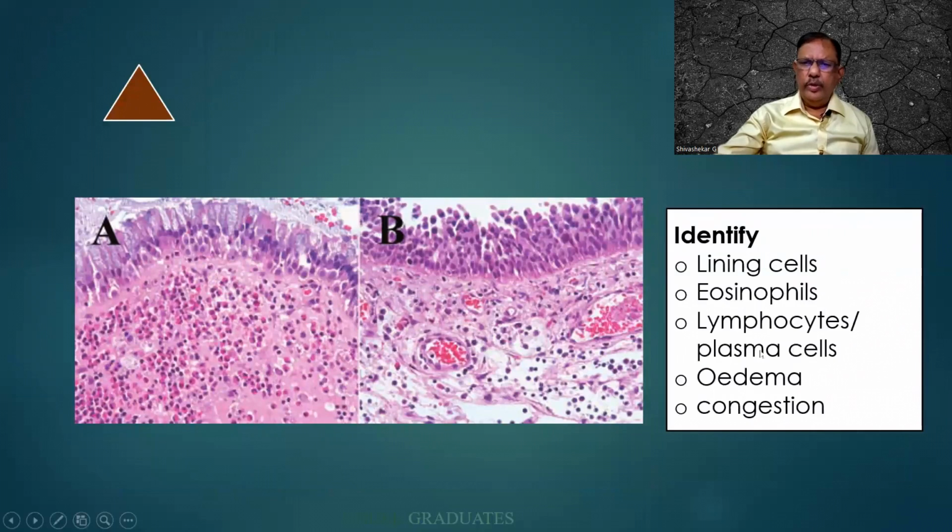Look at this picture over here. I would like you people to kindly identify these components. In one, I am finding again more of secretions. In another one, there is pseudostratification. Any of it can be kept for us. So, in this case, it is obvious that the cells are predominantly pink in color, though they are small.